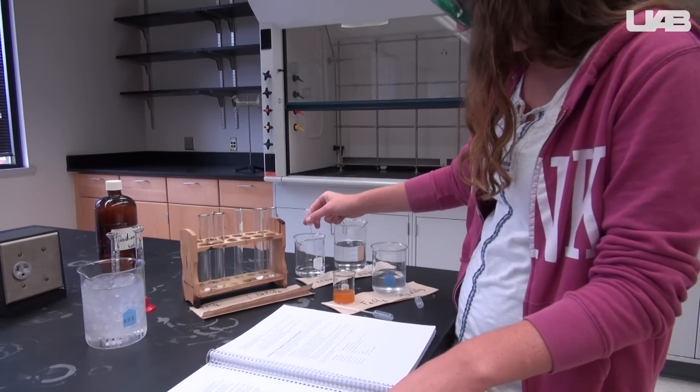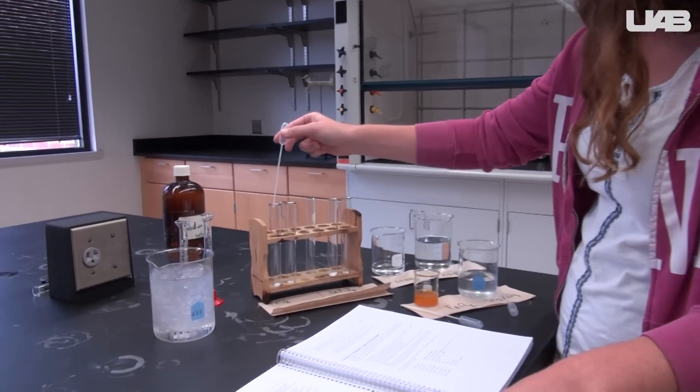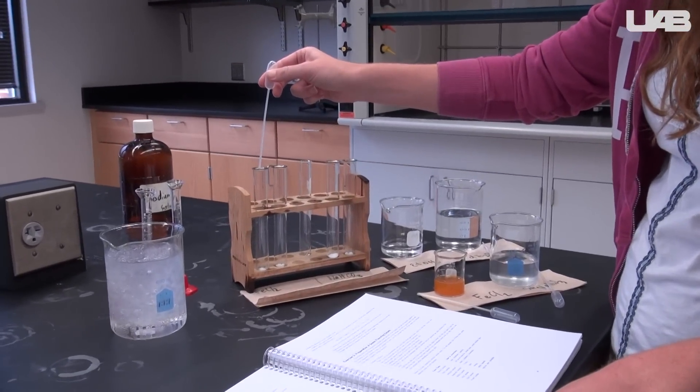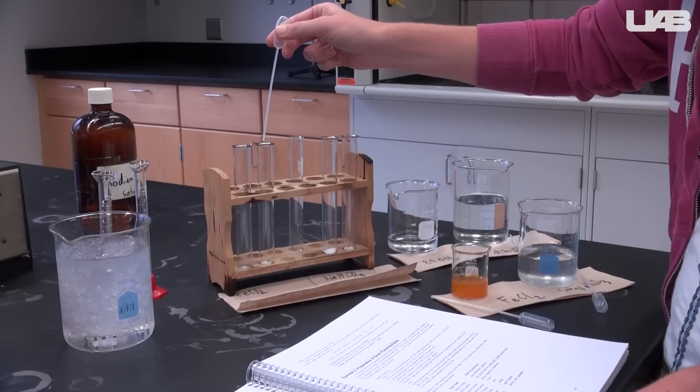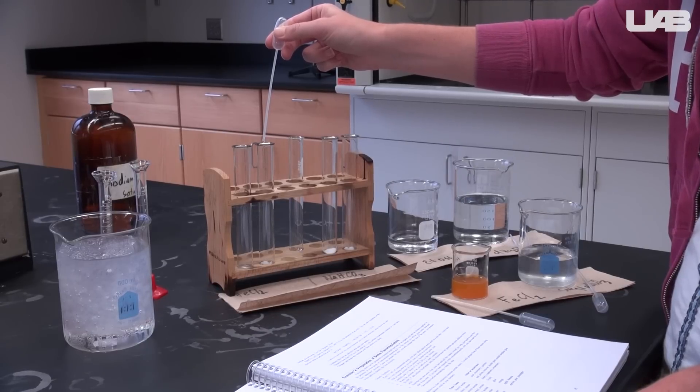For these tests, you will need a total of four test tubes. For each test, you will place less than 0.25 grams of your aspirin in one test tube and less than 0.25 grams of the stock aspirin in the other test tube.